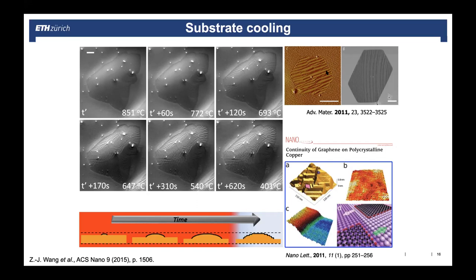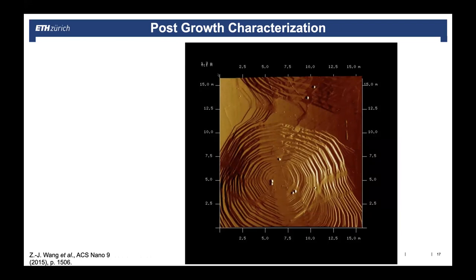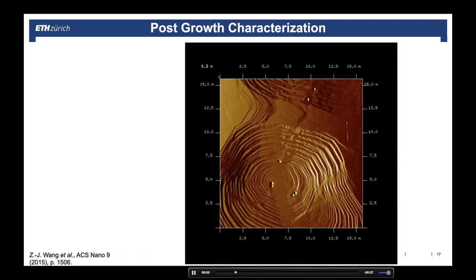And here, my student at that time was very, very patient. So he looked at these reconstructions and he saw, for example, nice traces. He did some AFM and stuff. But he looked at, for example, these silica particles that form etching traces. So there is some kind of graphene etching happening. And that is also happening because there's oxygen somewhere around.